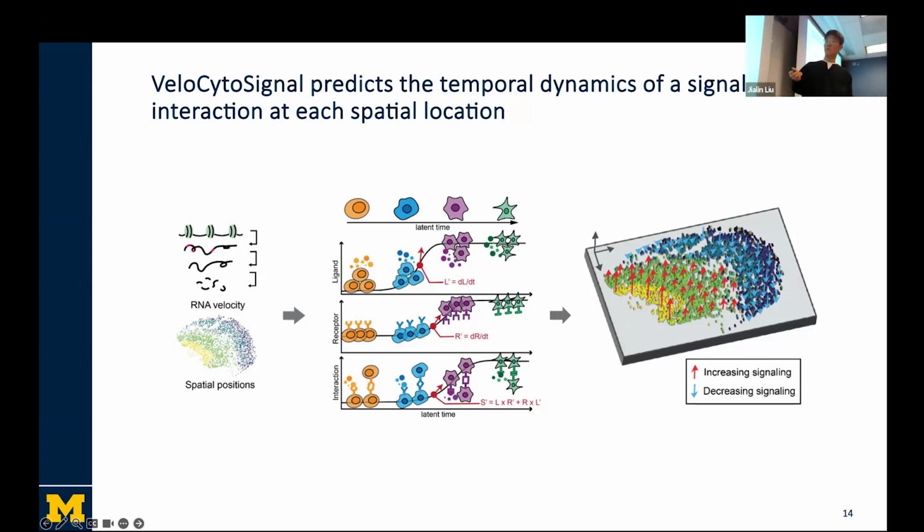It combines RNA velocity, from VeloVAE, which is another software from our lab that we developed for inferring the RNA velocity of the cells. By combining RNA velocity and CytoSignal, we are able to see whether the activity of each interaction is increasing or decreasing, directly mapped to the tissue plane.